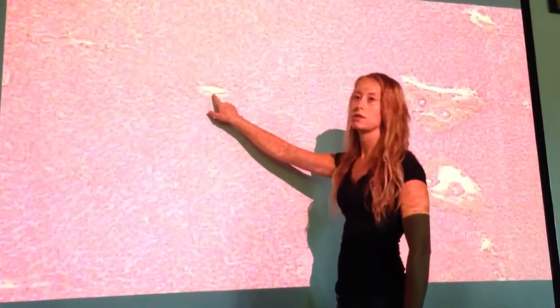Alright, so in this view, we can see two hexagon triads off here in the corners, and then over here in the center, this is our central vein.